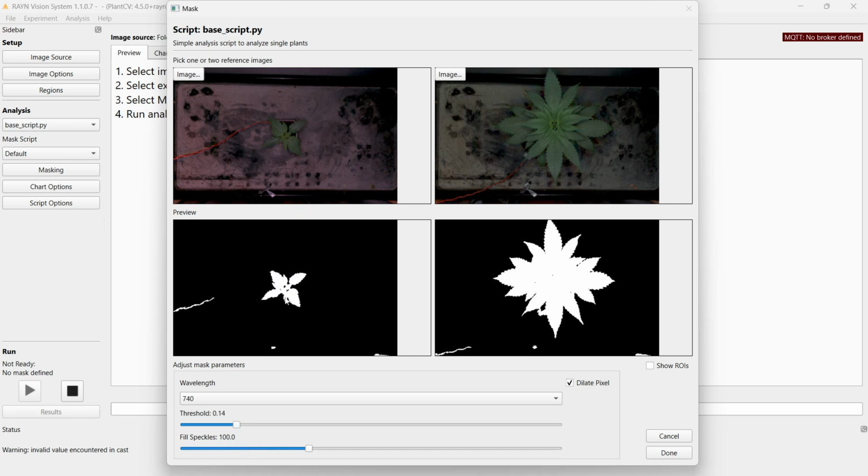So the goal is actually that we basically have all white where the plant is. This does not matter too much to us because we can also highlight the ROI right here, because the ROI does not touch this part, for example, this artifact or this right here. This is a reflection of this tape, and this does not matter too much to us. Right here we have one oddity. This leaf of the plant is not entirely visible.